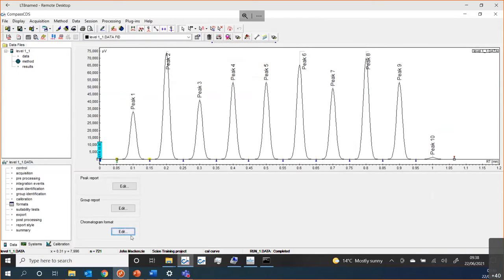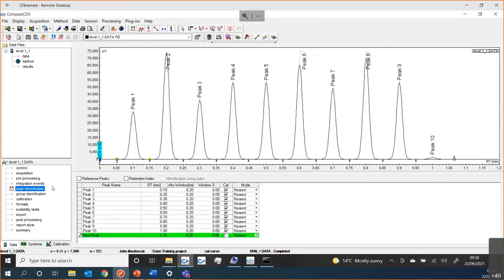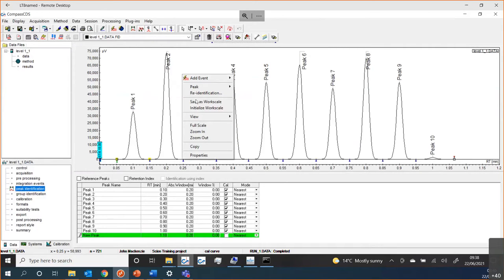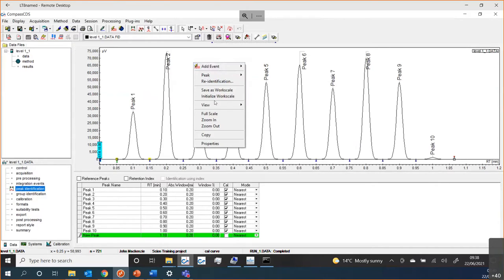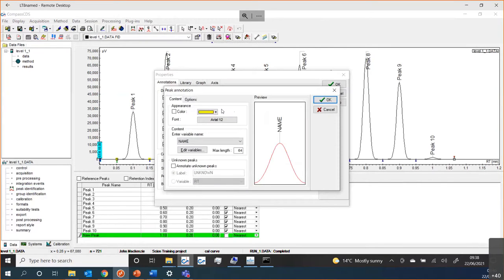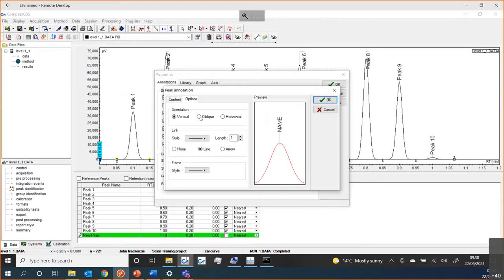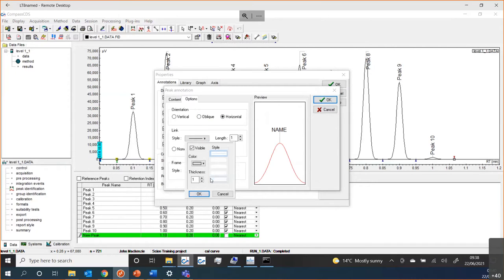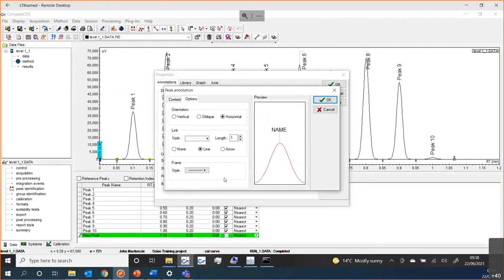I don't only have to do it from within there — I can also do it from my chromatogram. If I just right-click on my chromatogram, I can choose Properties and it will take me to the same screen and allow me to change any of these things. I have some options: I can have the peak labels be oblique or horizontal. I can change what my line looks like, the thickness, and the style. Lots of customization is possible for what your chromatogram looks like on the screen.